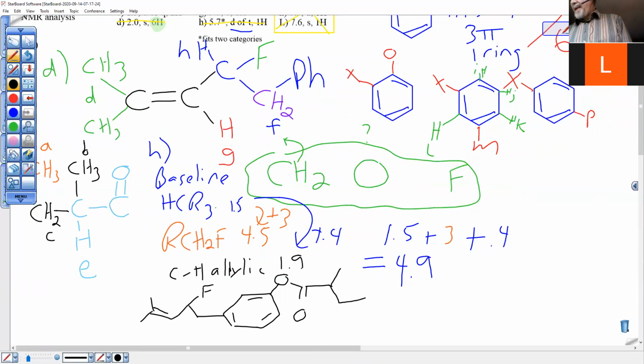And letters, just to finish up here, we have the 2 CH3s called D. We have the vinyl called G. We have the H here. We have the 2 CH2s called F. And let's see. Let's go over to the carbonyl. We called alpha the E. The CH3 was the B. The CH2 was C, connected to CH3 called A.